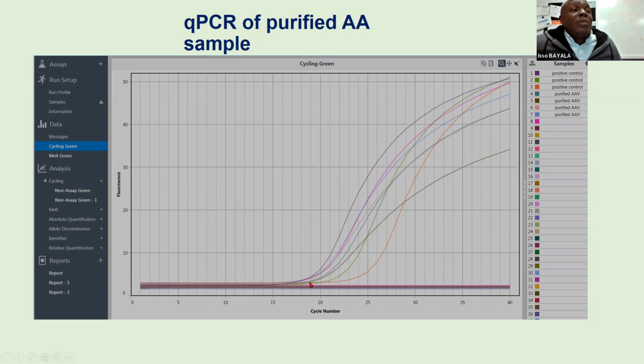But that's what you see on the screen when you run it, but this is not an integration. In the integration, the software calculates how much material is enough before it can actually quantify it in a way that is statistically valid. So that will be on the next slide.